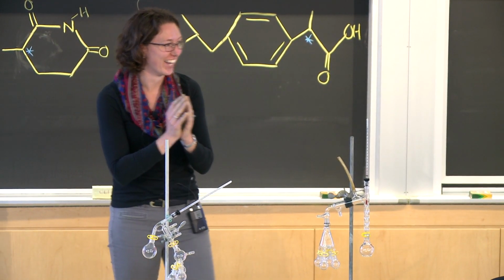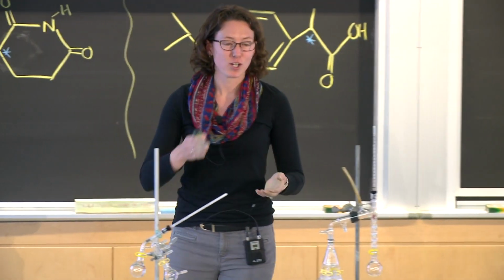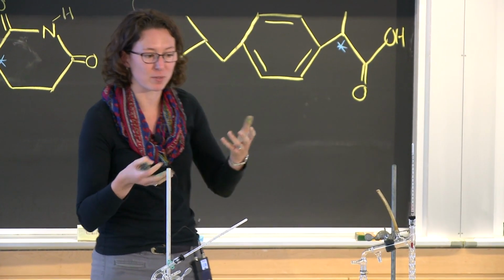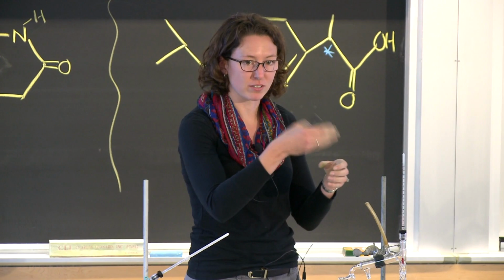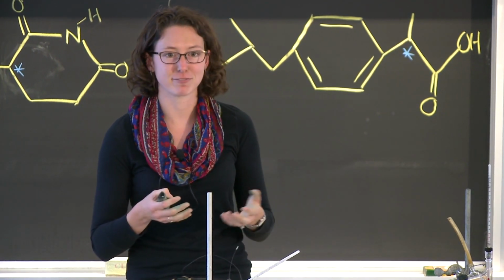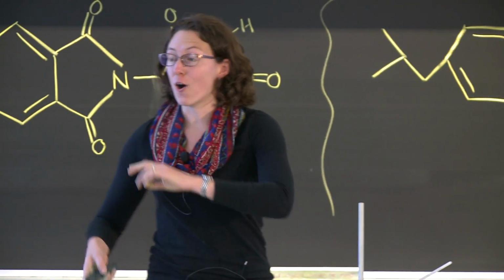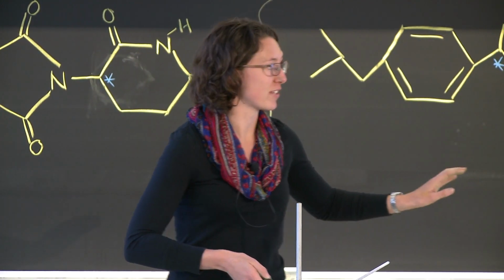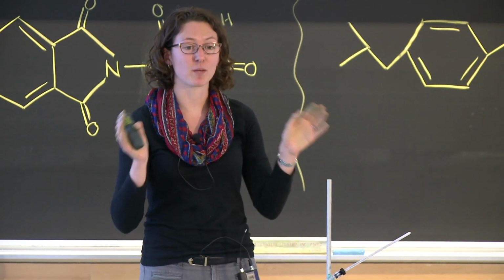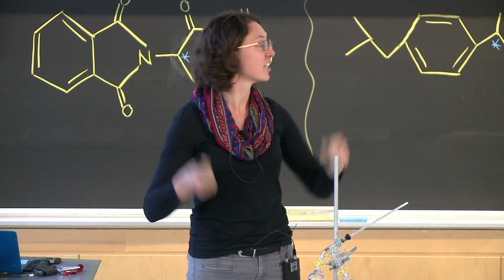Smell it. So yeah, part of the way that you can tell is you can smell it, waft it gently, don't ever stick your nose. So whenever you're trying to smell these, even though these are chemicals that people eat, be gentle, you guys know, and your TAs can show you if you're unsure, but don't ever stick your nose straight into a vial of any chemical. So yeah, we can check by smell, and there are a whole host of other ways that we are going to tell whether you successfully separated your 2 components of your mixture, and I will leave you with that, and we will talk about it on Thursday. All of the different ways you can determine your success.